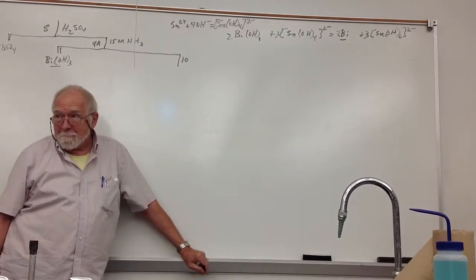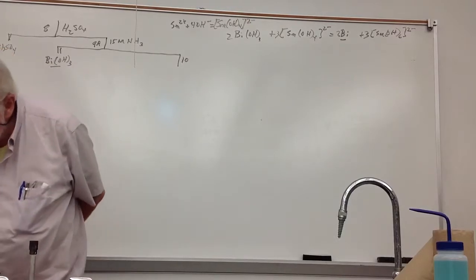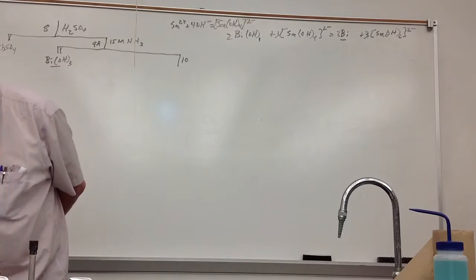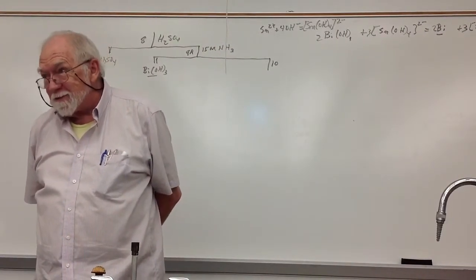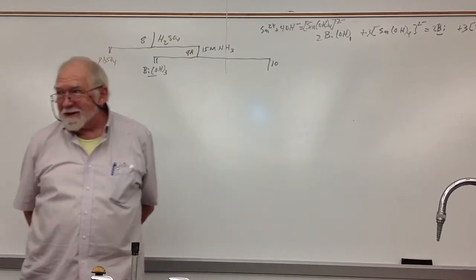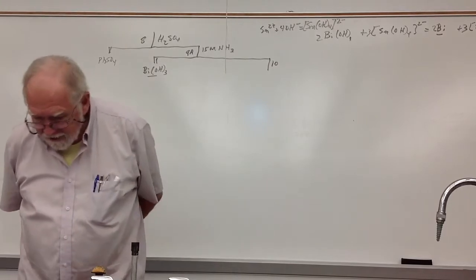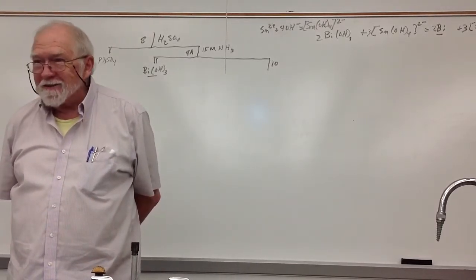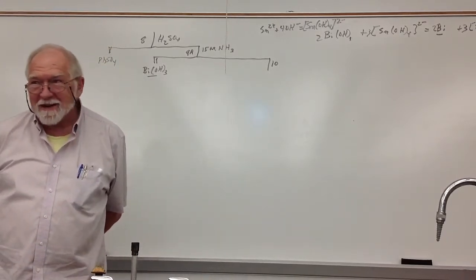Yes? You said 8 drops of it, and the paper says 3. Whatever it says. Maybe I wasn't reading. Oh, I read 8 molar. Okay, yeah, just start with 3 drops. You probably want to add a little more than that, but you'll find out because you'll get the white precipitate, and then you'll add more sodium hydroxide to get rid of it. Yeah, 8 wouldn't hurt, but let's save reagents, so let's start with 3. I don't have to fill the bottle as often. And if it makes the white precipitate, add a couple more drops.